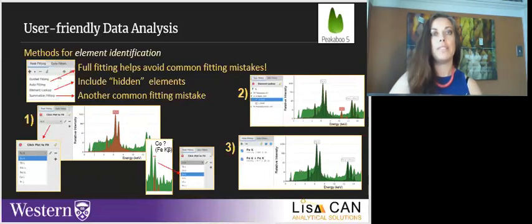Example 1 shows the fitting of the iron K pattern, including detector escape peaks below the recognizable K alpha, K beta peaks. But if a user doesn't recognize the K alpha beta pattern and clicks on the iron K beta peak to fit, the closest energy is the cobalt K alpha, but clearly the spectral pattern does not match the collected data. The user can try each suggestion until the pattern matches the raw data.